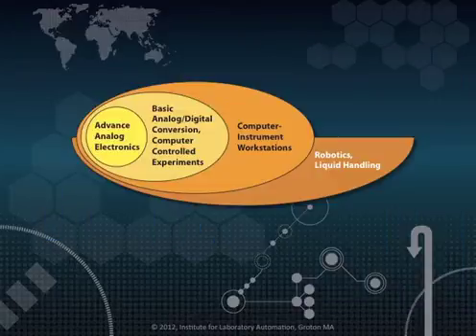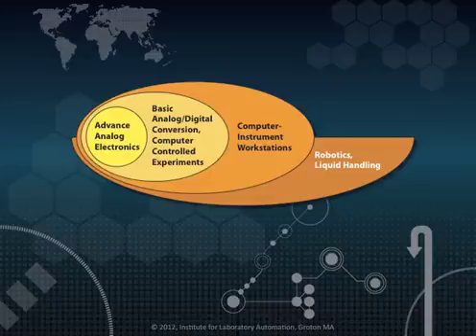The next type of technology we will take a look at is that of robotics and liquid handling systems. Sample preparation, that is taking samples, dissolving them, and getting them ready for instrument measurements and assays, is a labor-intensive and tedious activity. As we've seen earlier, discovery research can look at many thousands of compounds with tens of thousands of tests. Using robotic systems, laboratories can do the work much faster and at lower cost.